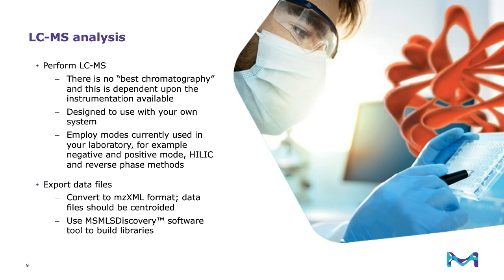For example, multiple liquid chromatography methods such as reverse phase liquid chromatography and hydrophilic interaction liquid chromatography, HILIC, can be used, and perhaps different LC columns employed, in addition to positive and negative ionization modes. Many researchers who have used the MSMLS preferred a basic C18 column run in both positive and negative mode, and then a HILIC or diamond hydride column is often employed to further separate the very water-soluble compounds. Several methods can be applied to ensure the analysis of all standards provided, because they're all chemically diverse.